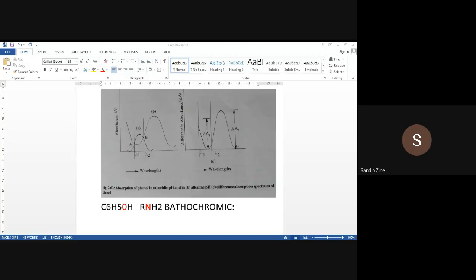Parab Omkar? Redshift, increasing the wavelength. Yeah, but what happened exactly in shift? Redshift, you are talking about redshift, but what exactly does shift of absorption mean? The absorption maximum is increased. Is the shift of absorption towards longer wavelength or lesser wavelength? Longer wavelength. Very good. Redshift, bathochromic. Yeah, very good.